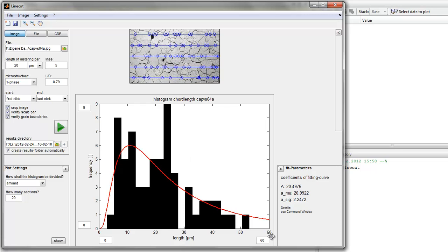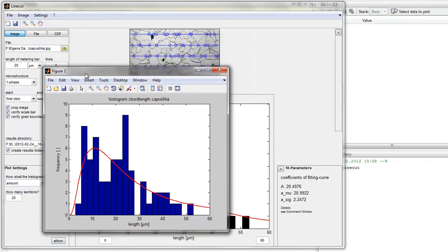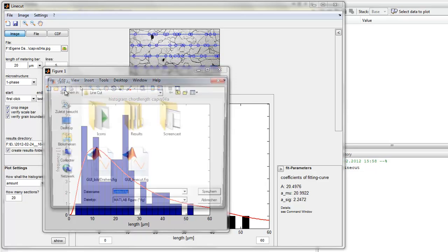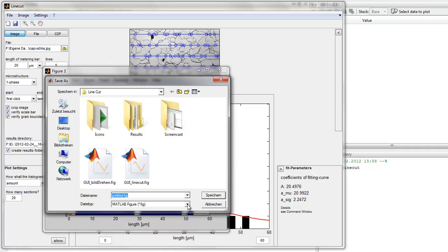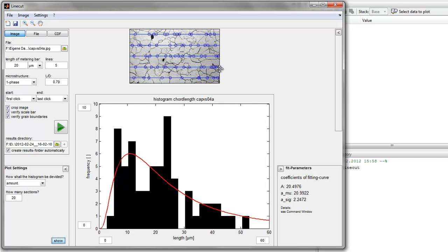If you are ready with the histogram, you can show it and a new figure opens with the histogram and all your settings. Here you can make changes to the axis labels and save the figure as a file — a .fig file or something else as you need. This was a short introduction to the analysis. Hope you enjoyed.